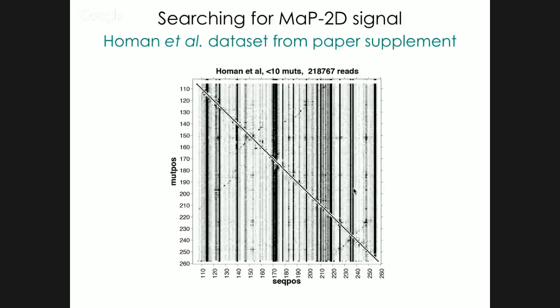And then Pablo wrote an initial analysis code to transform this simple file into two-dimensional data. So this is the data derived from their simple file, but presented in the manner of our mutant map experiments.